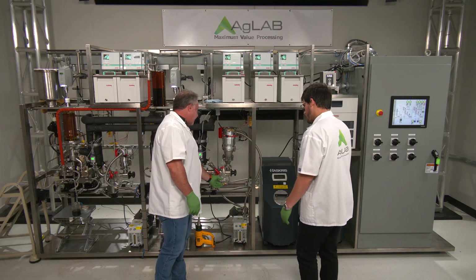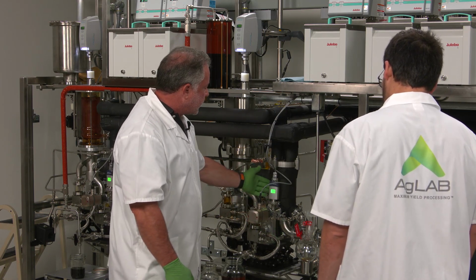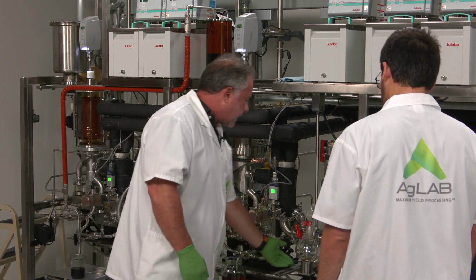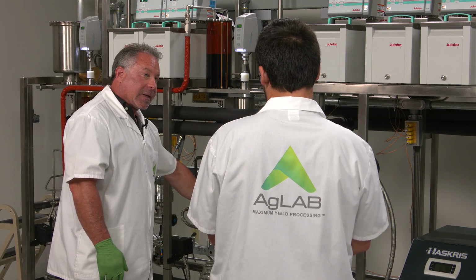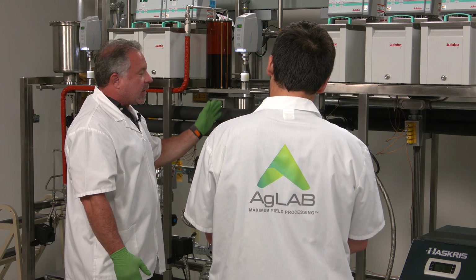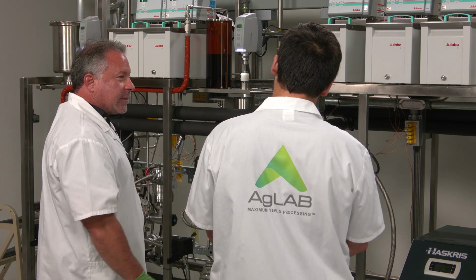And that's one of the things that we get on this side back over here too. So all that extra volatiles that are coming off, we're saving our vacuum pumps with our cold trap, and that's why you see all this extra stuff coming off over here. So that's some of that there. Or it's coming over in here if we condense it down, if we're at the wrong, I shouldn't say wrong, temperature, but not the optimal temperature here. We're going to have more color come into this section and change the color of our distillate.